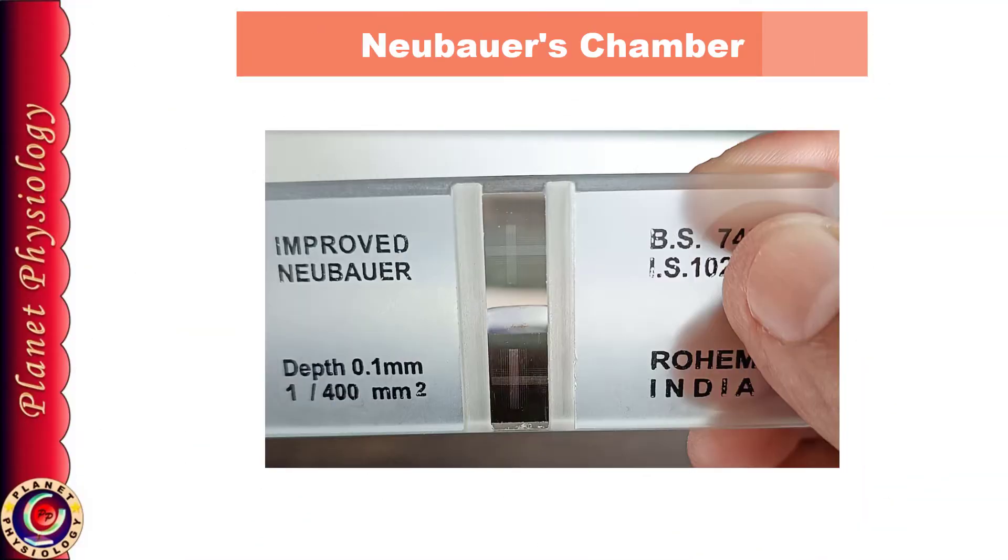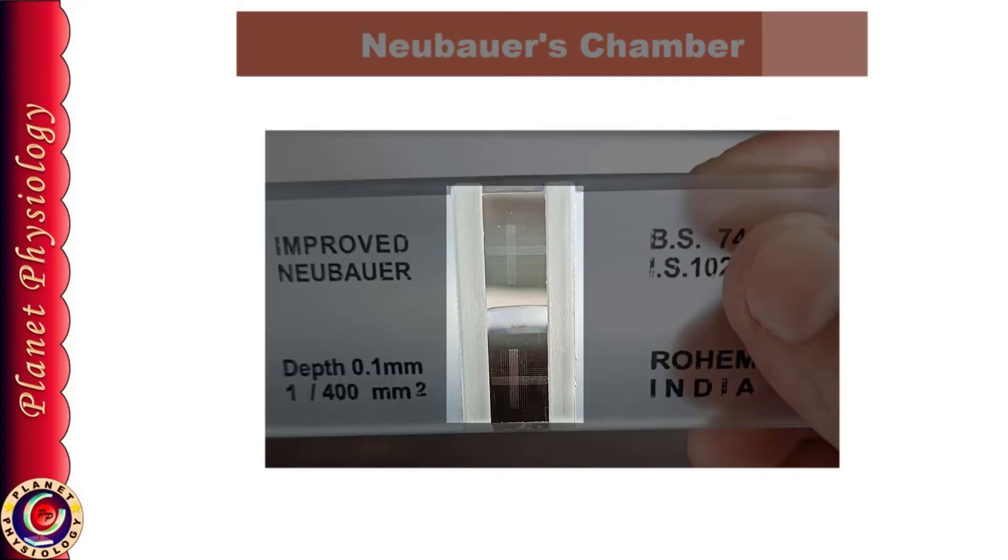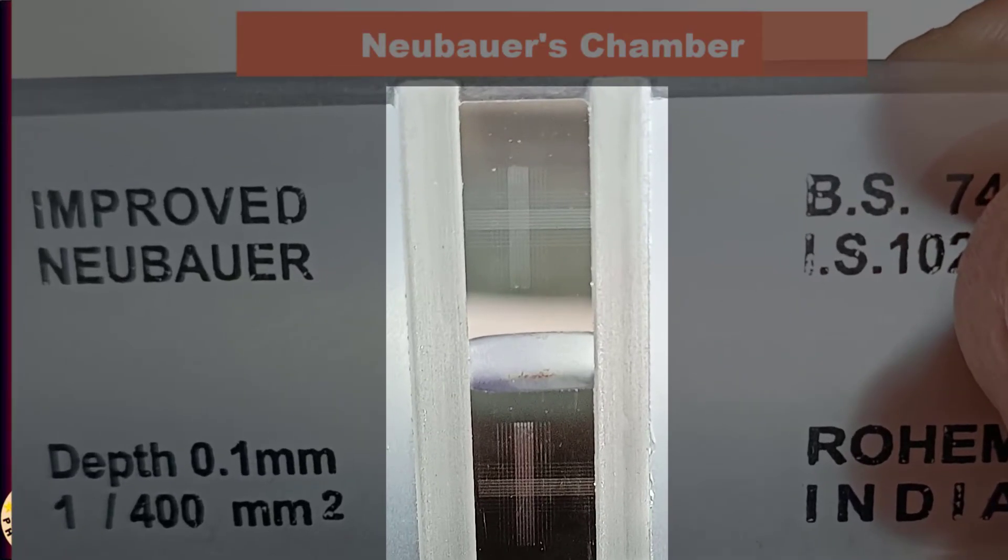This is the Neubauer chamber and if you observe this central counting area against light, you can easily notice plus sign on either side of the platform. For counting various types of cells, we need to focus this part under the microscope.